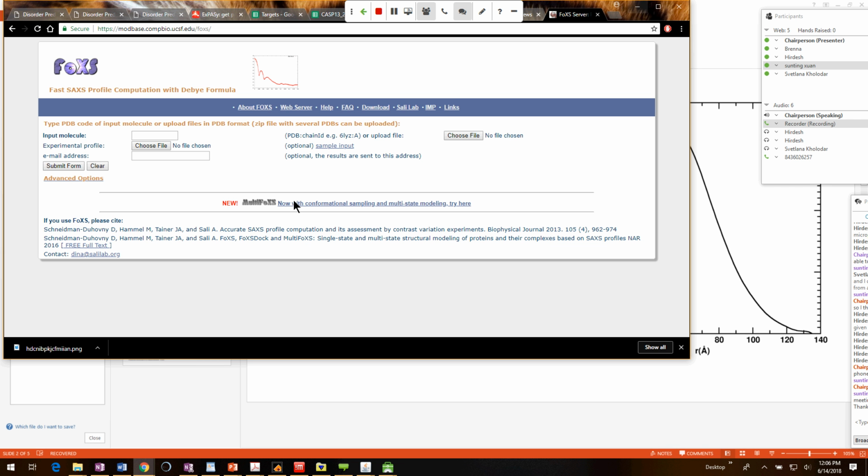But you also do SEC? Absolutely. The way that we run it is we're going to run high-throughput SAXS during the day and SEC-SAXS overnight. We're just opening up the application process for this, and it should be available in this August time. Okay.